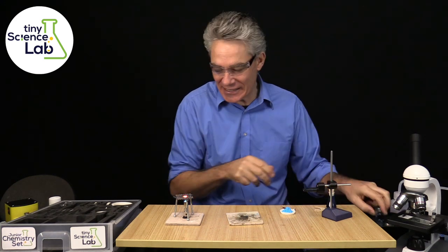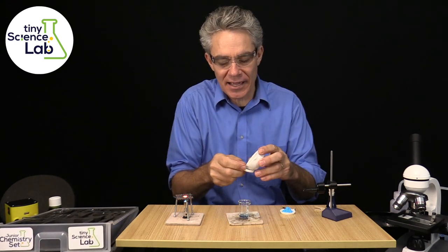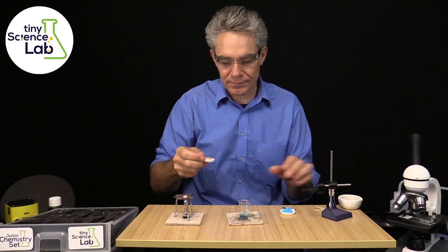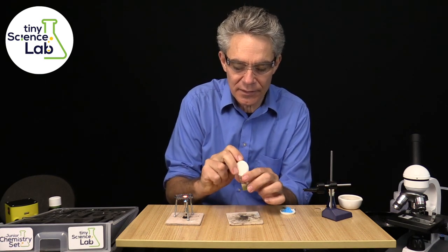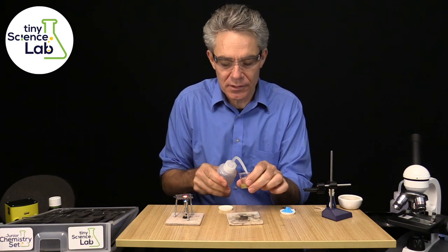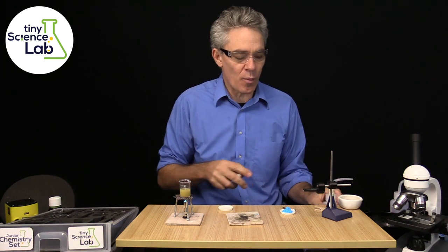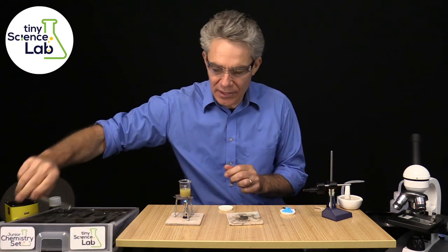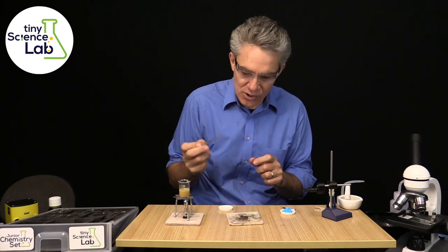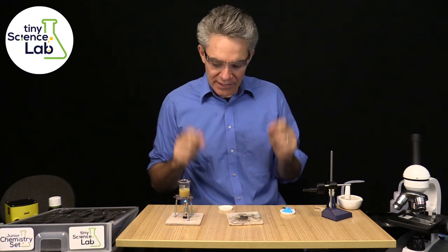Now an absolute classic experiment in high school is to separate a sand-salt mixture. So I've got a sand-salt mixture here. Let me put that into a beaker and I'll add a little bit of water to dissolve it. The salt will dissolve quicker if I warm it up — no problems at all. I'll give it a little bit of a stir to dissolve that salt, so the salt is now dissolving in that mixture of sand, water, and salt. And I need to do some filtration.